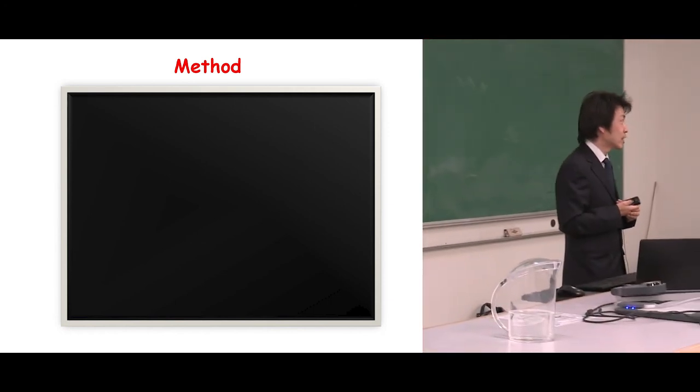And sometimes you need to use an absorption pad to give a little bit of power to drive the flow in. And this is a portable imaging system. The signal is captured, then we can calibrate the signal with the color, and we determine the mycotoxin concentration.